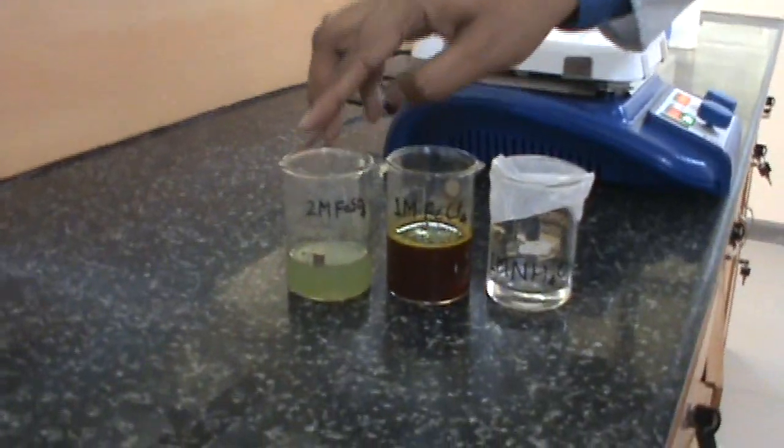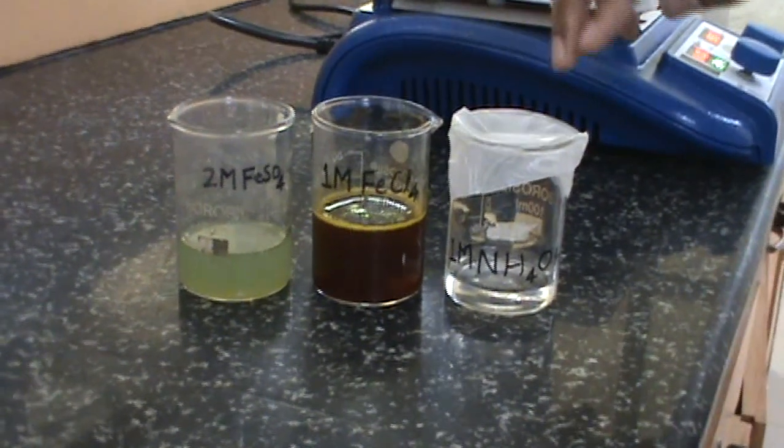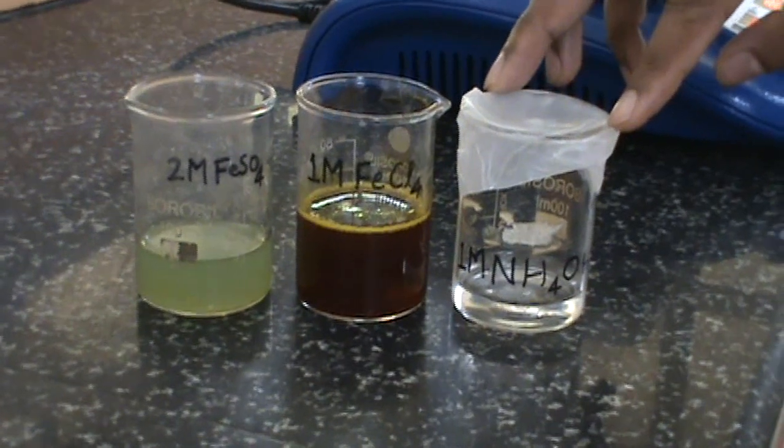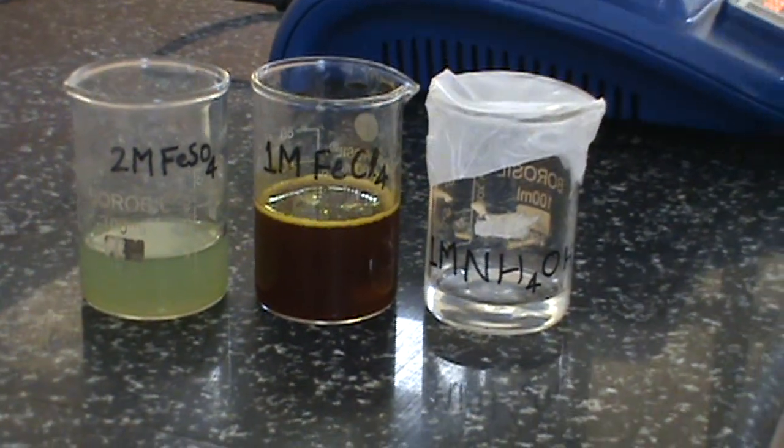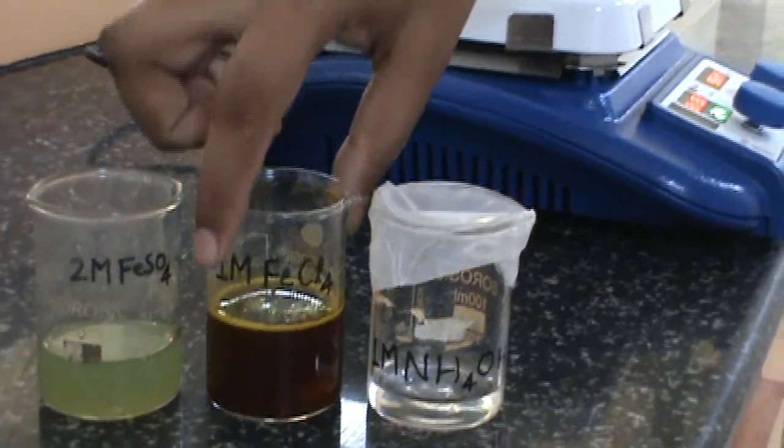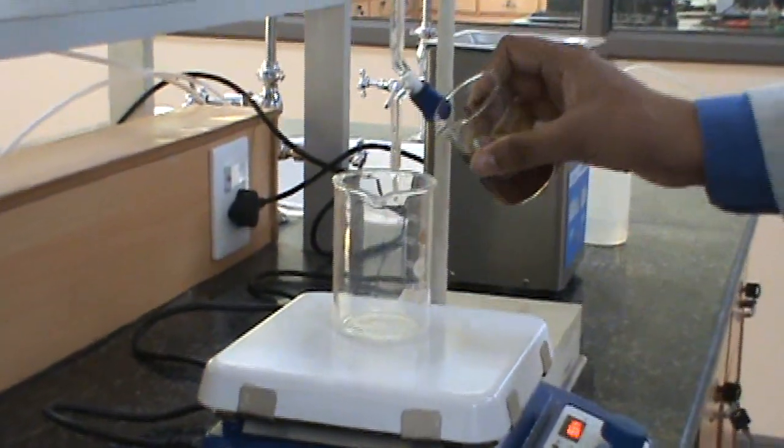We have here two molar FeSO4 solution, one molar FeCl3 solution, and to precipitate out the iron oxide we have ammonium hydroxide. To begin with, we will take FeCl3 solution.